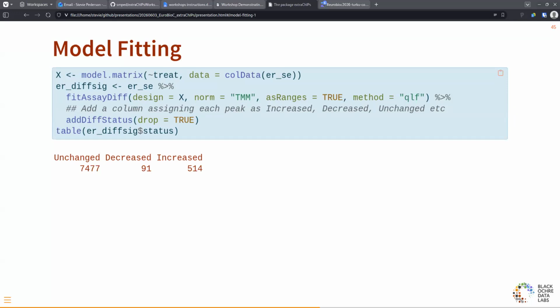And yes, if you are familiar with SummarizedExperiments and you just like to fit standard DESeq datasets, you've got a SummarizedExperiment, so you can fit it using those methods, if you like, just being careful with your normalization strategies that you're not accidentally choosing the peaks. That's why I like to have it slightly set aside from that, so you don't fall into a very easy trap to fall into.